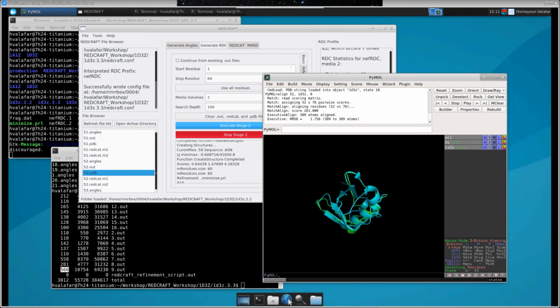By the way, at this point I must clarify that if your structure is supposed to be a beta sheet, don't be surprised if you don't see the beta sheet illustration, because at this point, your structure does not have side chains, and the required hydrogen bonding that may be needed by these illustration programs to identify something as a beta sheet may not necessarily be portrayed that way.